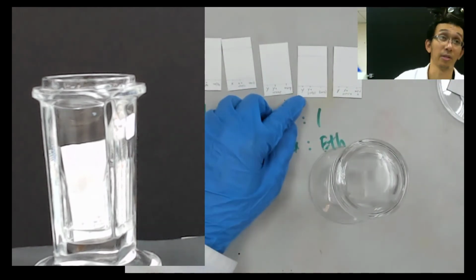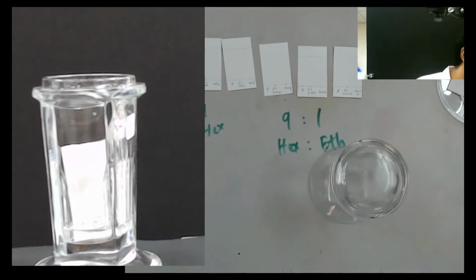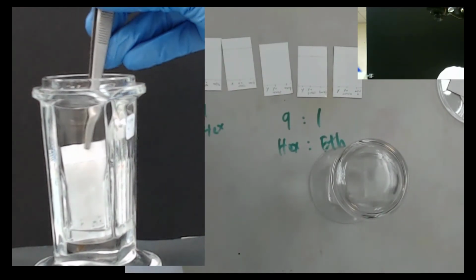You need to take out the thing. So later I will set the camera first. But now I need to wait because now it's near the top. After this, I will use the camera. Hopefully you can see. Okay, now. Nearly. 2 seconds, 1 second. Okay, done. Oh, basically you need to close actually. Okay, that's better.